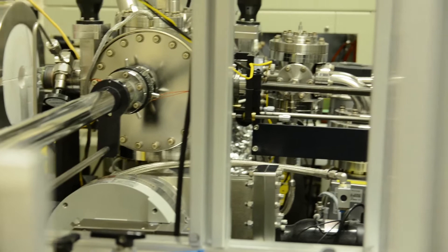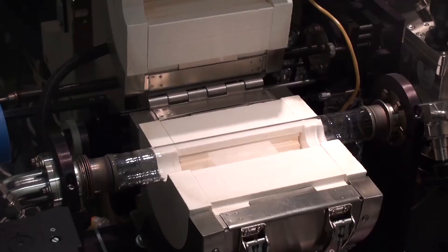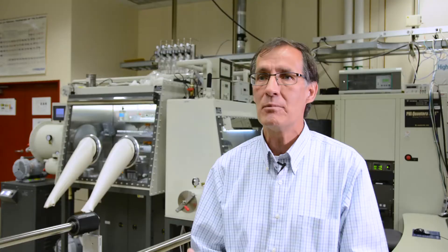This instrument is an X-ray photoelectron spectrometer and we bombard a sample with soft X-rays to derive the chemical composition and bonding environment of the elements in a sample.